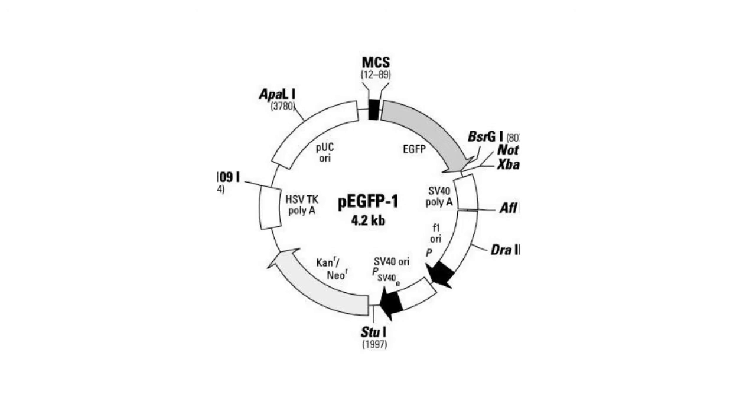In this illustration, the gene is for the green fluorescent protein. The green fluorescent protein was originally from the jellyfish, but now we know about many other different types of fluorescent proteins in various organisms. So in this illustration, the gene is shown for green fluorescent protein, but now we know about many other different types of fluorescent proteins, including red fluorescent protein, cyan fluorescent protein, yellow fluorescent protein, and so on. So by using different types of fluorescent proteins, we can label a target protein, and then we can find where in the cell that protein is located.